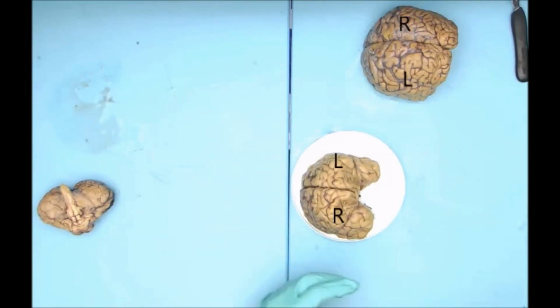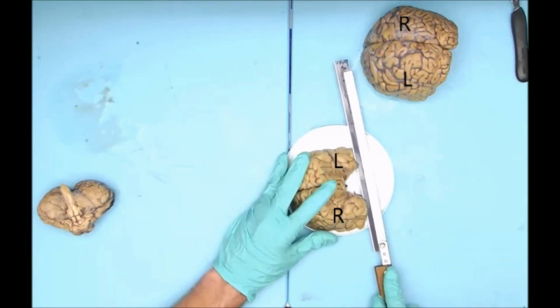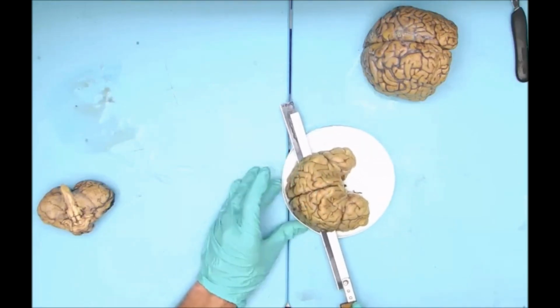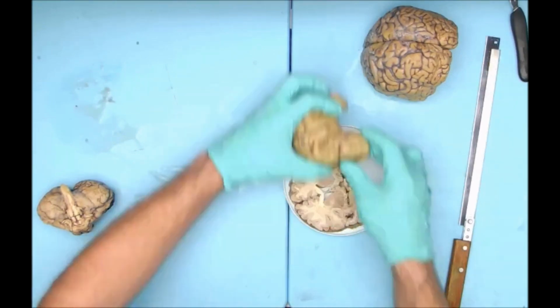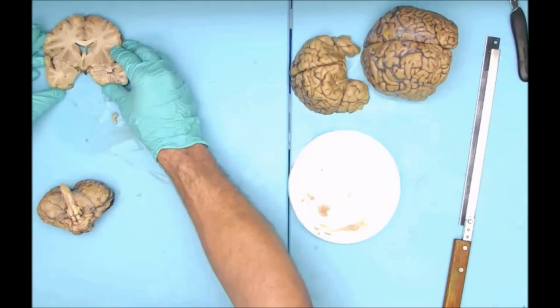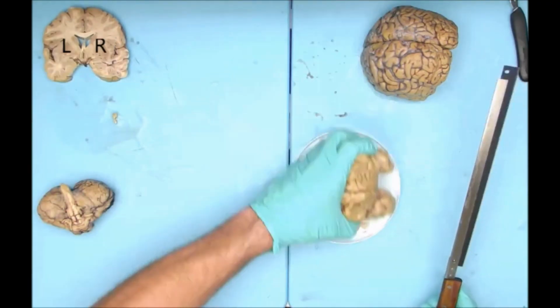Please note the laterality noted here. And so I'm going to make these sections. They're about 1 centimeter in thickness. And once again, I'm using a lid to make the sections more uniform. Now pay attention to the way I flip these slices and lay them out.